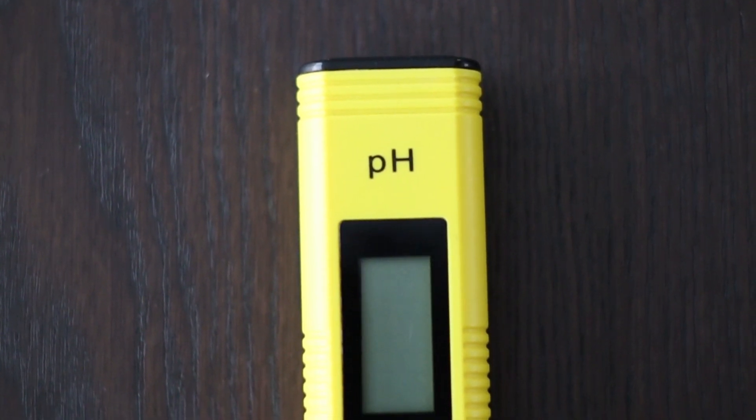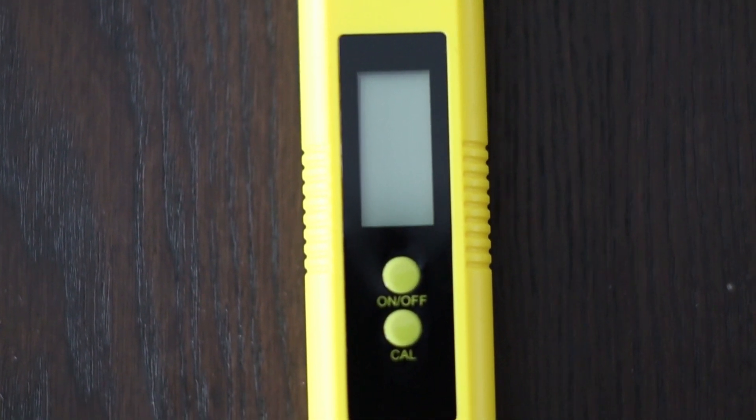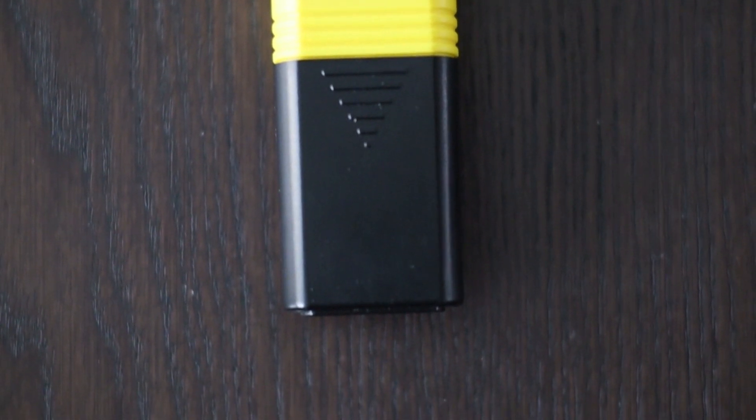It's been about a year since I got my pH meter and calibrated it. I haven't calibrated it since, so I know it's overdue. This meter will have to be calibrated multiple times a year since the numbers will drift over time.